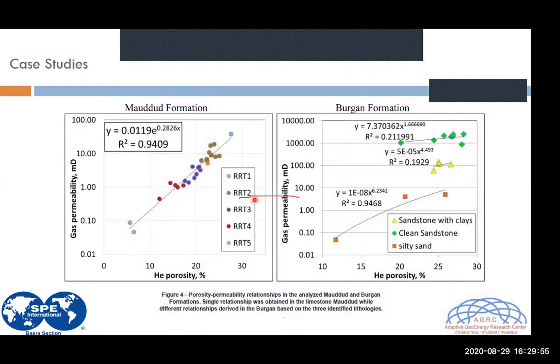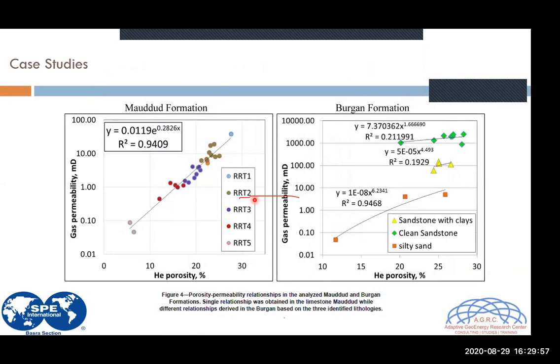And again, once you identify these regions, what is described here as RT1s, like rock type 1. But once you identify these specific regions here, you can try to correlate them, use this kind of trends again. Yeah, if you have a good correlation, as this one here, that's a common example. So in the other parts here, they identify 3 different regions as well with a trend.